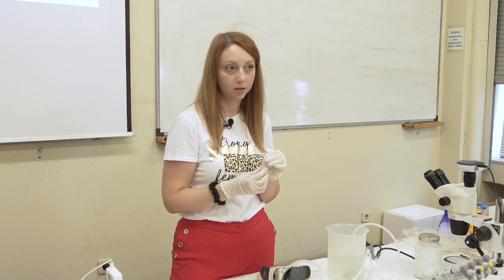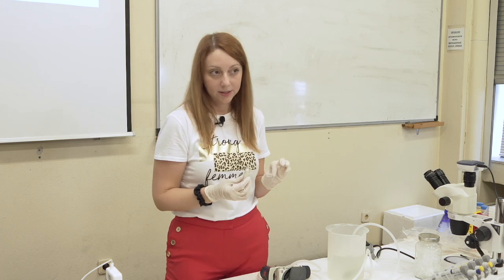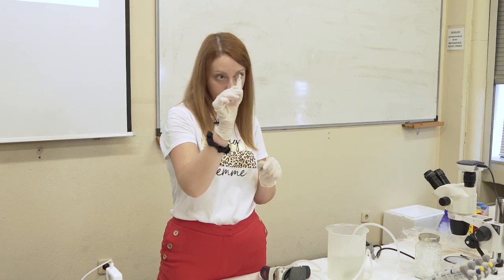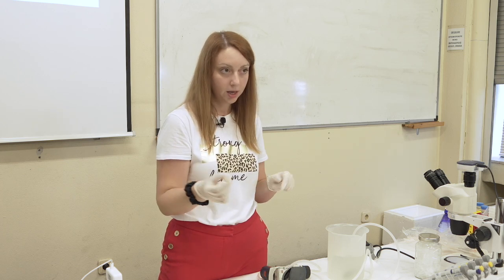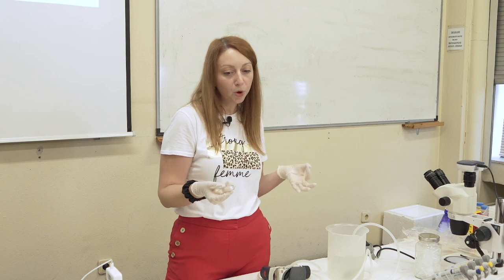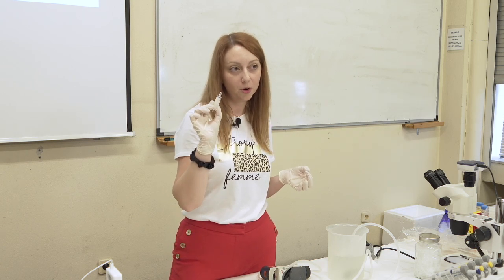How many liters can you filter with this? It depends. We have succeeded in filtering around 1.5 liters with this kind of filter, but it depends on the environment and how it is. The minimum volume that I succeeded in filtering with this is 400 milliliters.